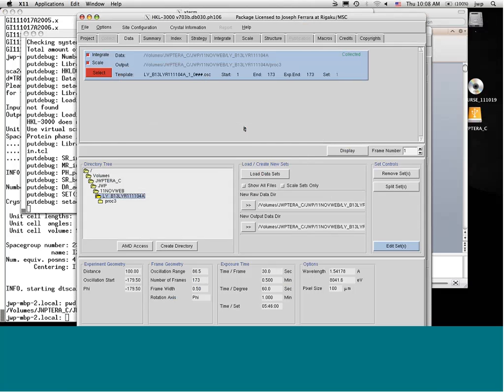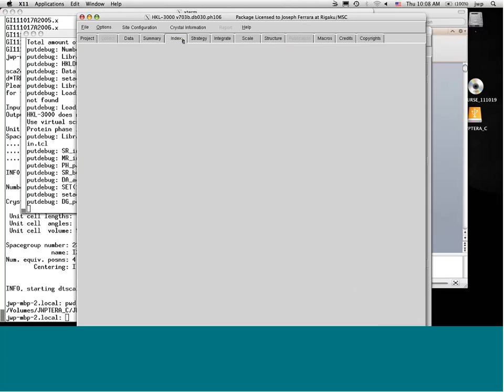And I know I talked to some of you yesterday or by email. I said I might use some of your images. These are images collected here, and I'm not using your images today. So this is standard HKL2000 for some of you.